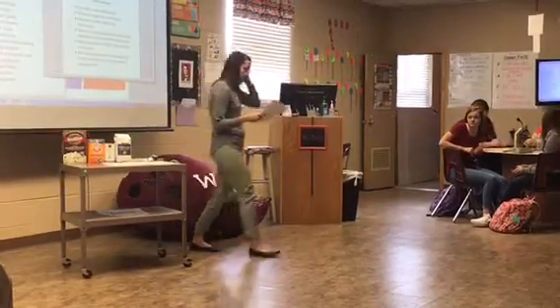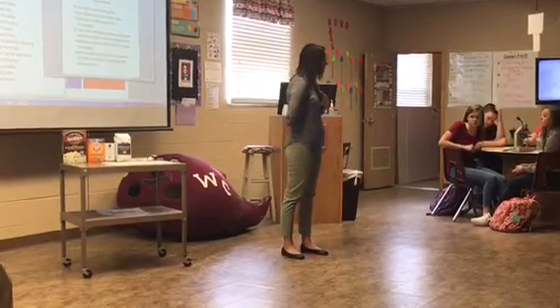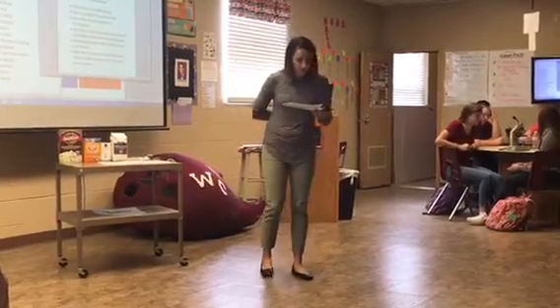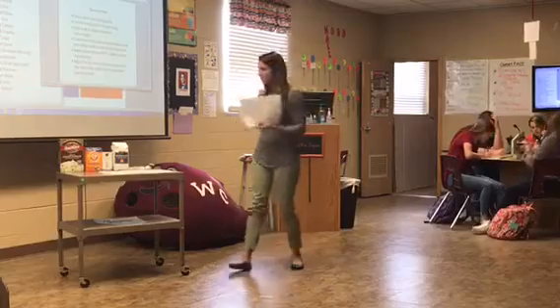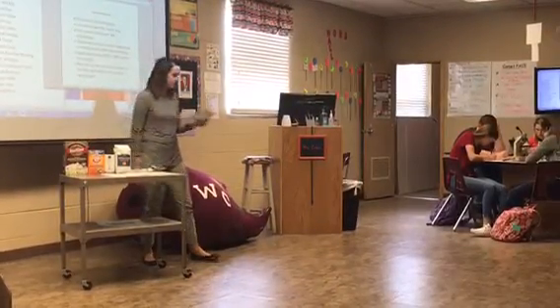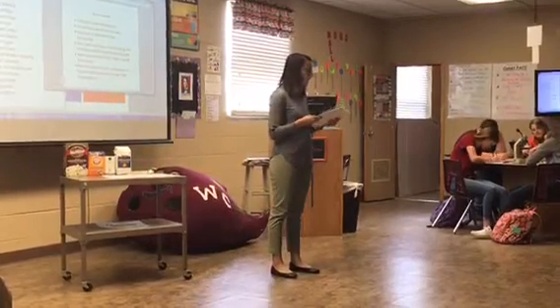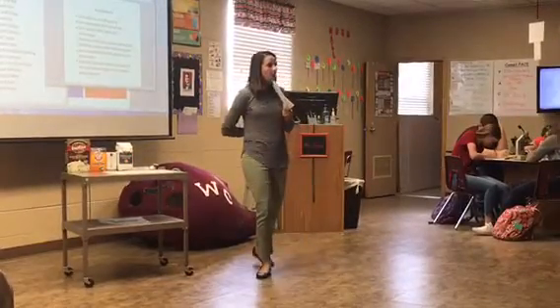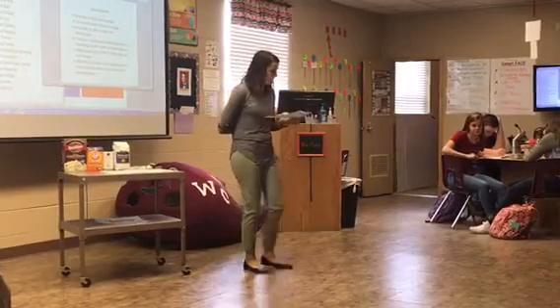Alright, so we have a little change to make to the substances because some of them were hard to get, so we kind of improvised. Alright, so instead of sand, mark that out and it's mashed potato, instant mashed potatoes. And that's going to be represented by slide 1. So go ahead and put a number 1 beside it. All these slides are numbered so you know which substance you're looking at.